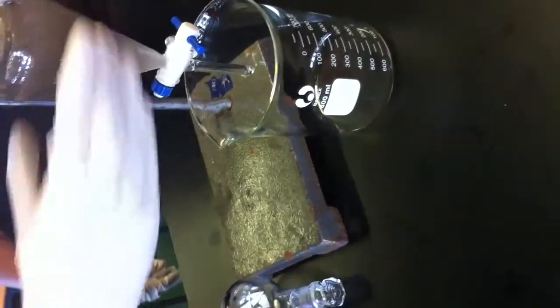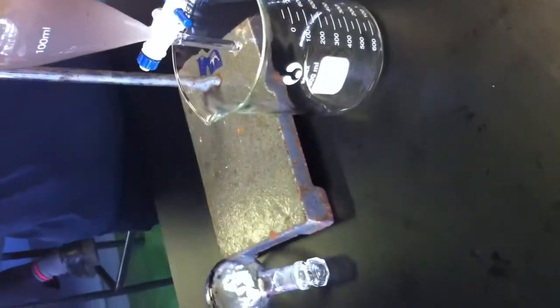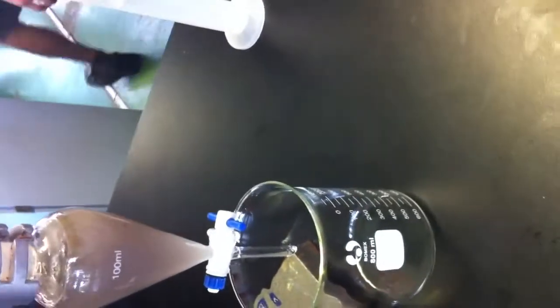I'm having a bit of a secret water bath because in the exam I always set it up on a water bath. And the water bath distributes the heat evenly. The heating mantle is a lot quicker. But the water bath distributes the heat evenly and most schools don't have them. So, what are you adding to the test? Oh, you can do either. It doesn't matter. It's easy to draw. You can just put a hole into it.